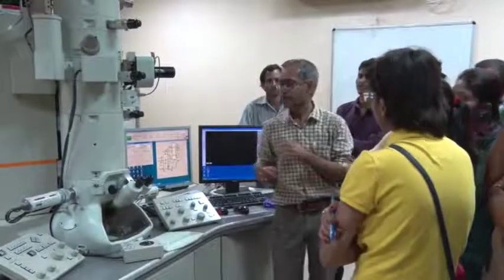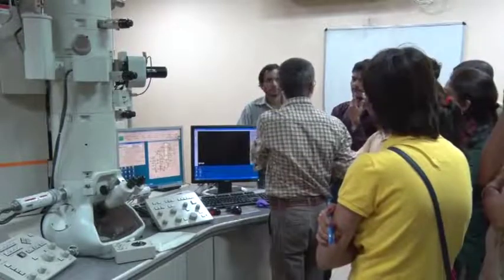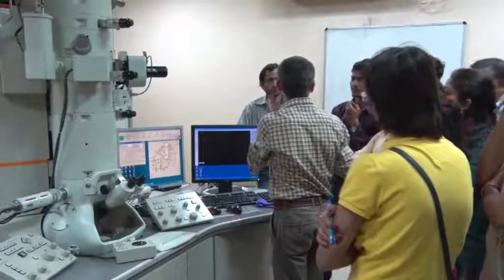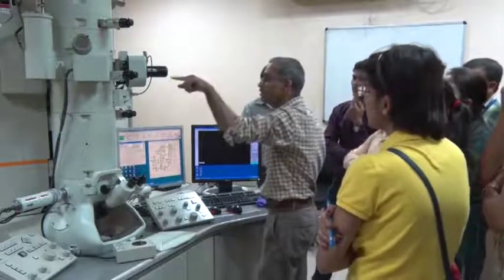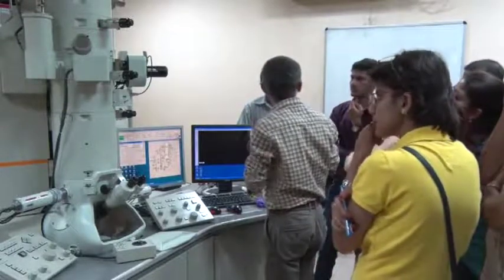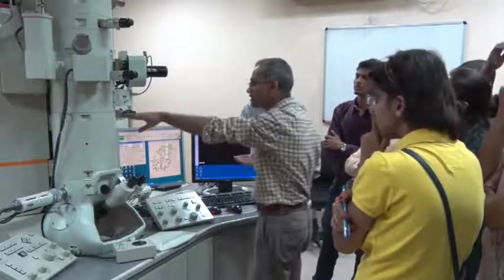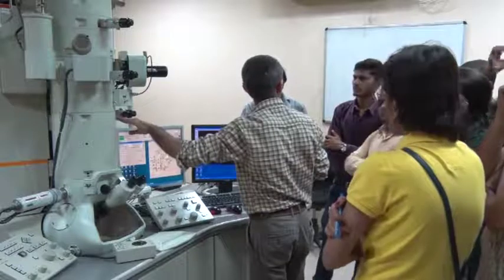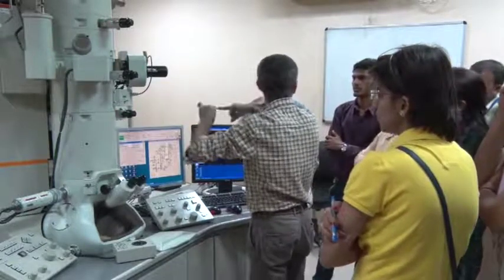We want to select the area of the sample. One way would be that you put your aperture right in the plane of the sample itself. But that would not be practically feasible. So you put it inside the selected area aperture. This is the first intermediate image. So in the image plane you put the aperture.